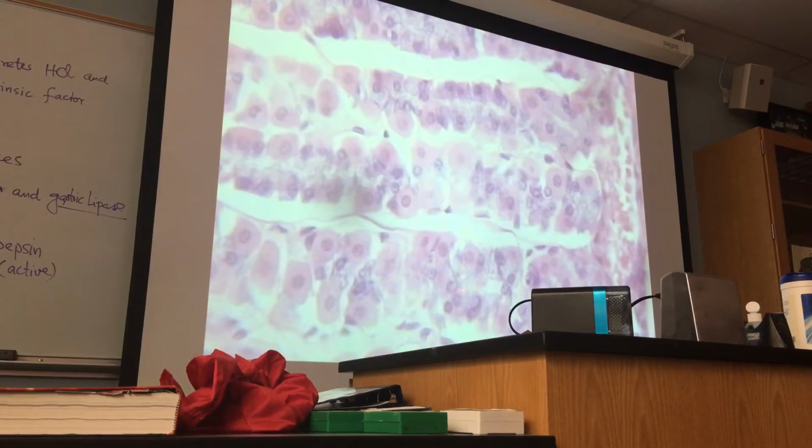You can see some chief cells here. But these are parietal cells. Like here is a chief cell. You can see, chief cell. These are parietal cells. Parietal cells are unique. You can see that the cytoplasm is pink or looks a little dull red.